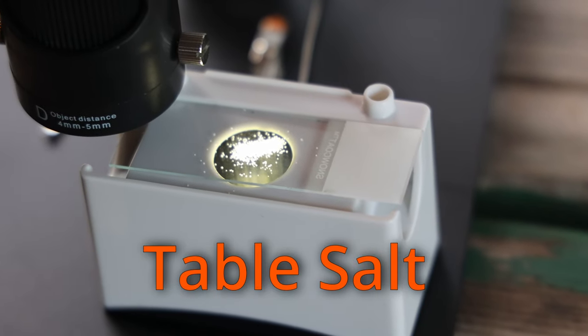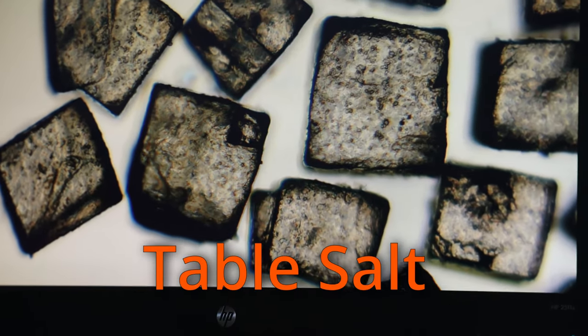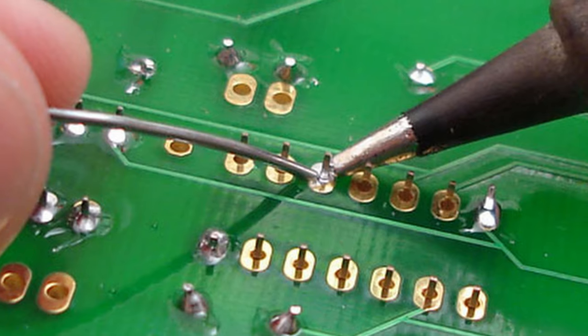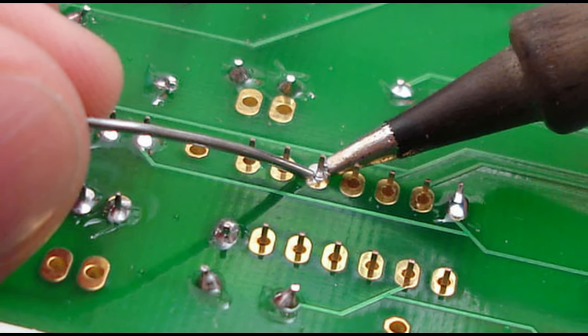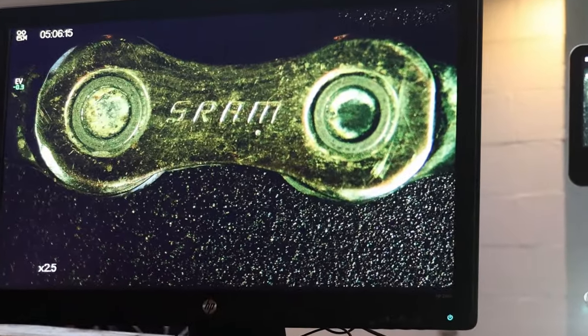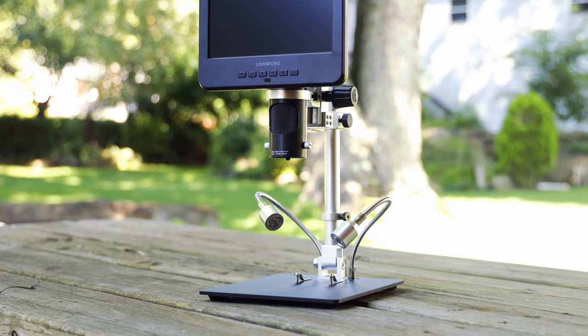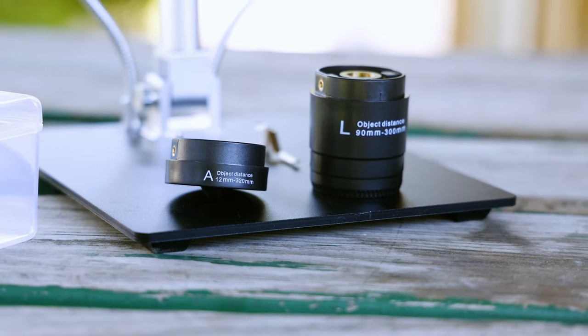My final thoughts on the LinkMicro 7-inch color digital microscope: for the money, it doesn't seem bad. I was really impressed that it was able to see microorganisms in pond water — that blew my mind. Sure, there was a little vignetting, green and purple fringing, which I'd expect in less expensive units like this one. For soldering and just seeing things up close, it's fine. The only thing that was sort of a pain — and this isn't the first microscope in this class where I encountered it — is that there's a ton of backlash in the focusing knob, though I did get used to it after a few times. All in all, the LinkMicro is the third microscope sent to me for review, and I would say I like it the most compared to the others. I'd like to thank LinkMicro for helping make this video happen.